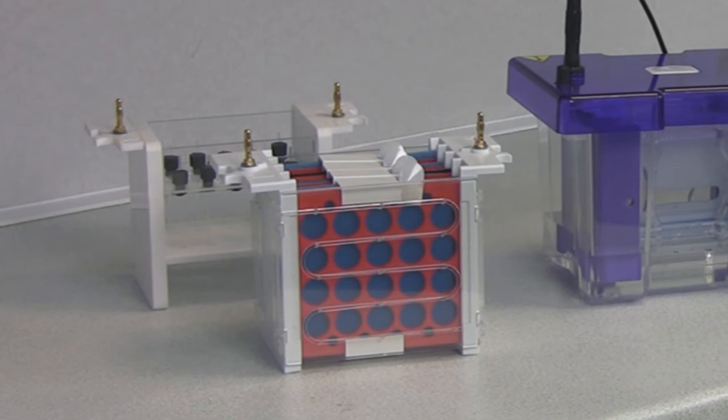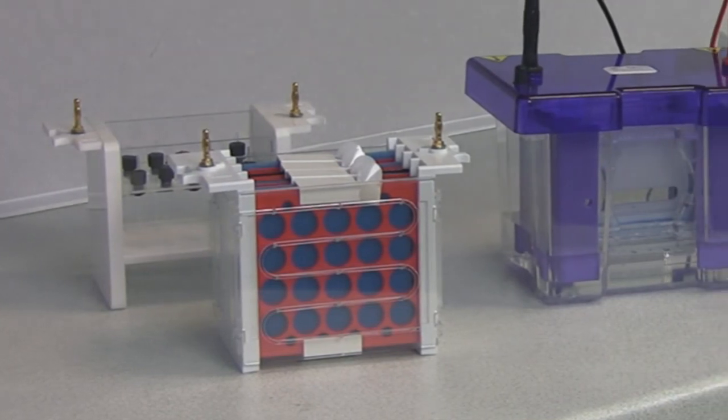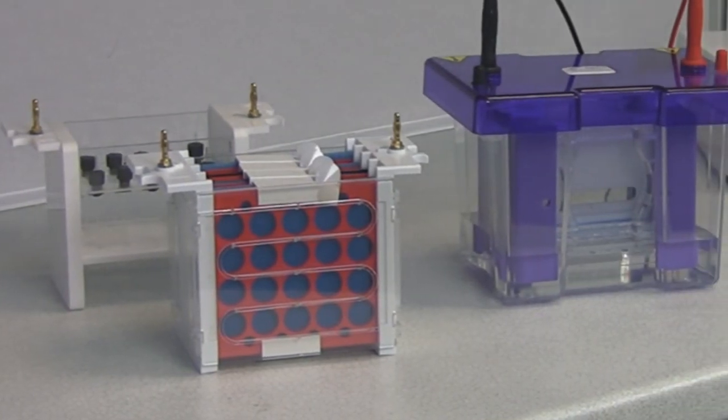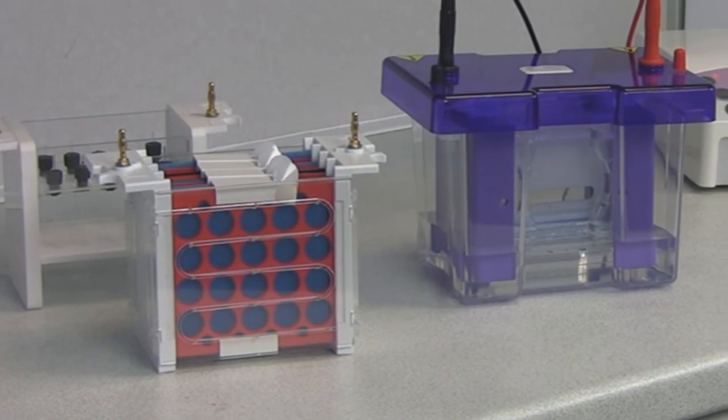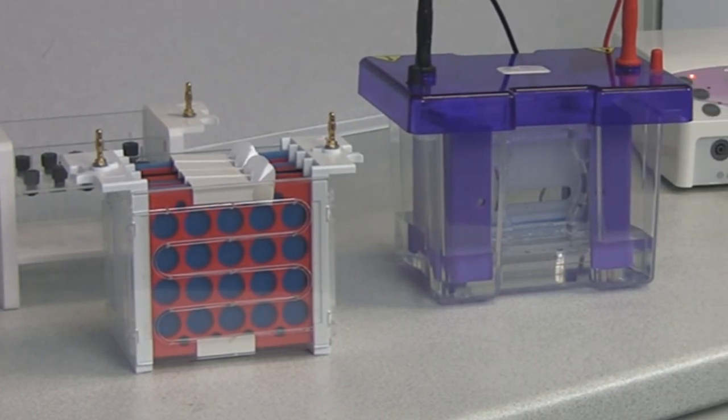Interchangeable modular inserts for isoelectric focussing and electro blotting allow the user to switch quickly and easily from one electrophoresis technique to another.